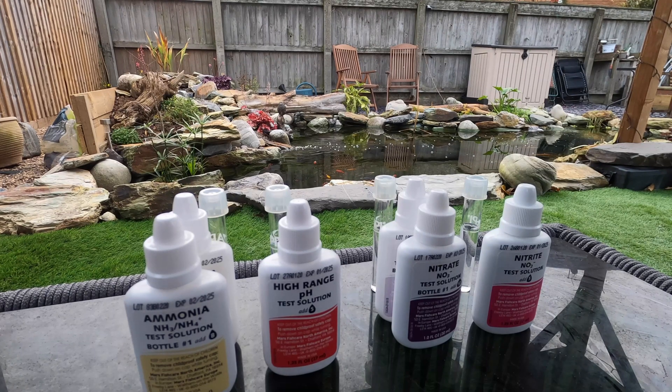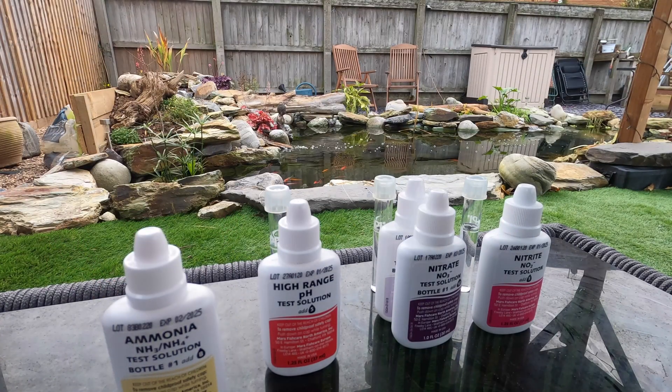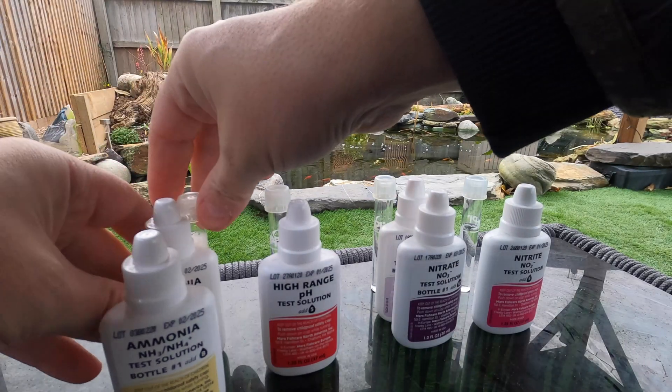Using the syringe we've got five mil in each test tube and we're going to work in order. We're going to do the ammonia first - we take that, put eight drops of the first solution in, cap that off, and put eight drops of the second solution in. The instructions are really clear and simple to follow - it says shake vigorously for five seconds. We're going to sit that behind the ammonia bottles and give that five minutes to develop.